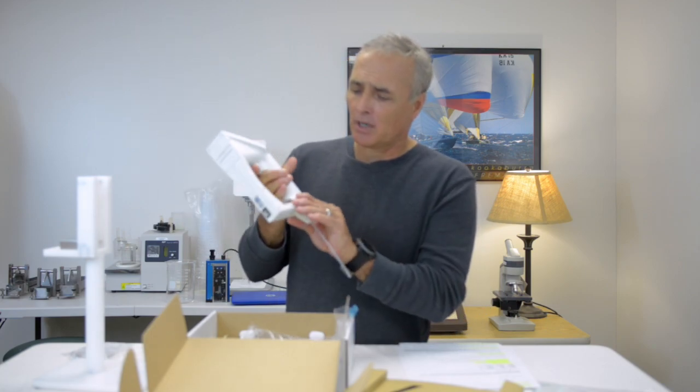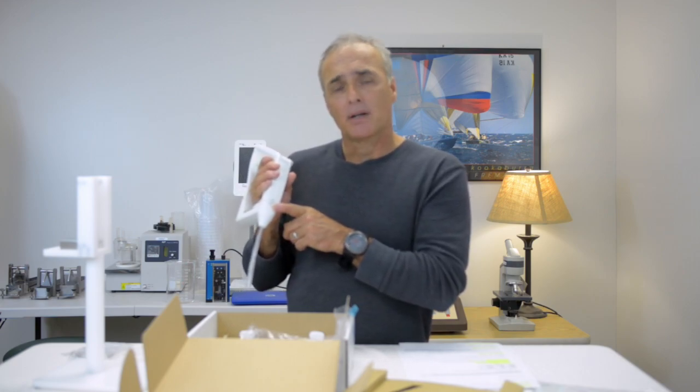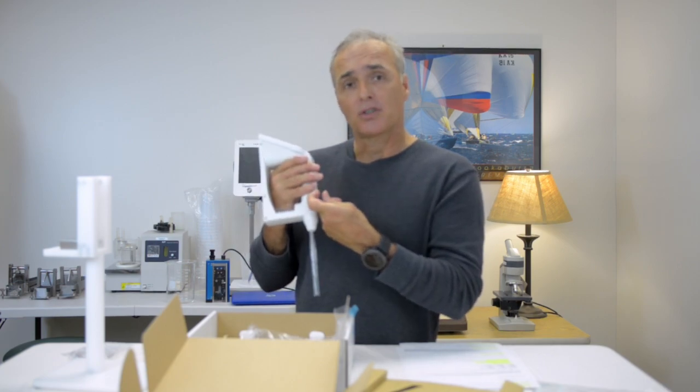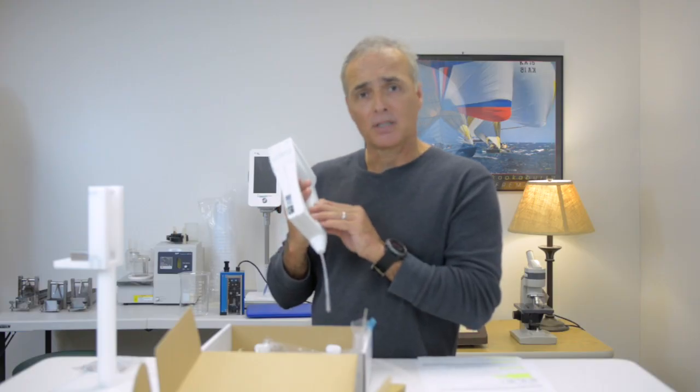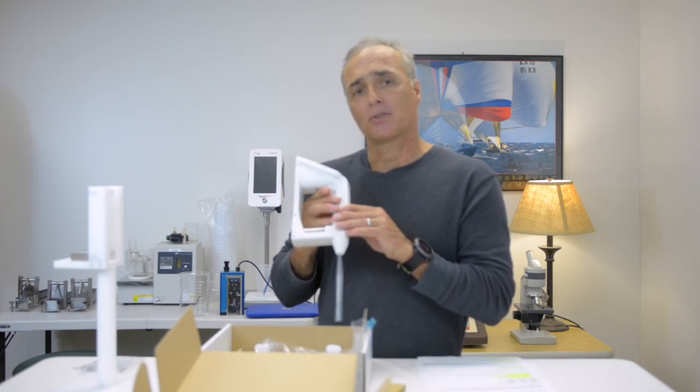One other feature: on the front here you have a port where, for samples that are more viscous, you can use a syringe and inject your sample directly in without using the tube. There's also a replacement bellows pump that you can put inside for samples that have particles in them and that might crystallize during sample testing.